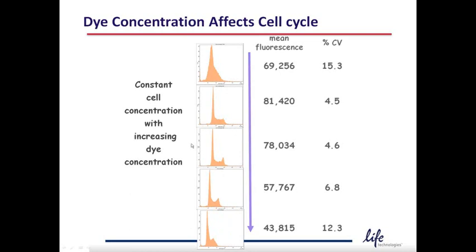And so these are things to consider. Most of the protocols that have been developed for these different dyes have some guidelines on where to start, but often you will still have to optimize for your particular cell system.